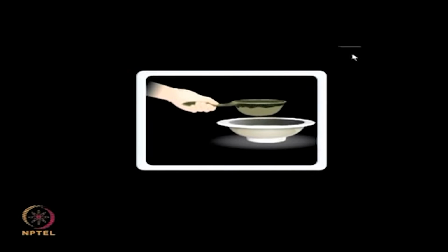Let me give you an analogy of gel filtration with a sieve. This process is very similar to separation of small particulate matter from food grains using a sieve. The larger grains remain behind the sieve, while the smaller sand or stone particles pass through and are removed. In keeping with this, the gel filtration technique is also commonly referred to as molecular sieve. Now, let me show you how this process works.